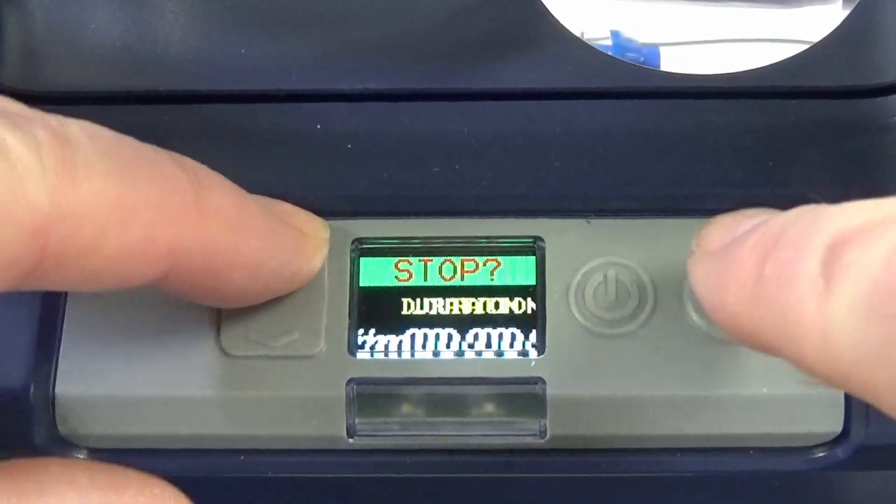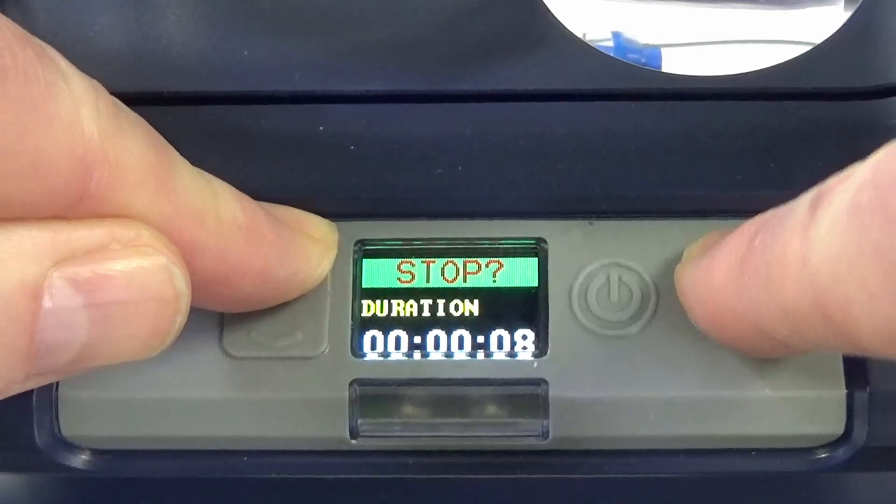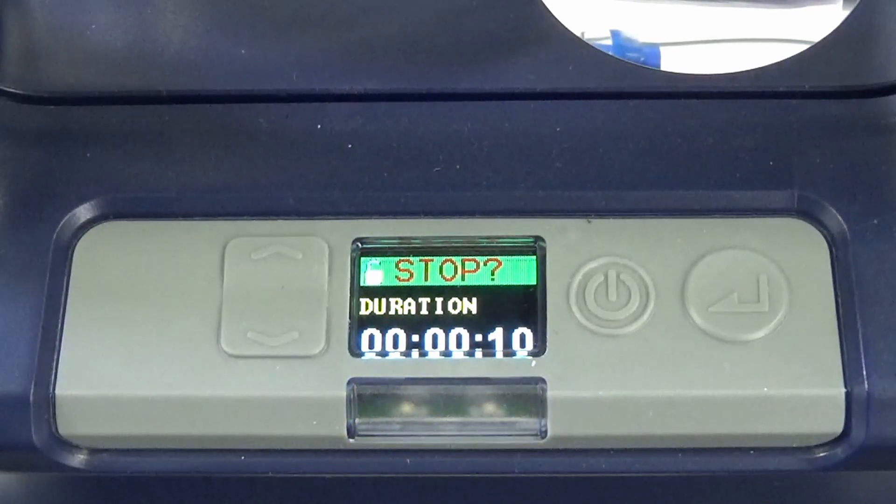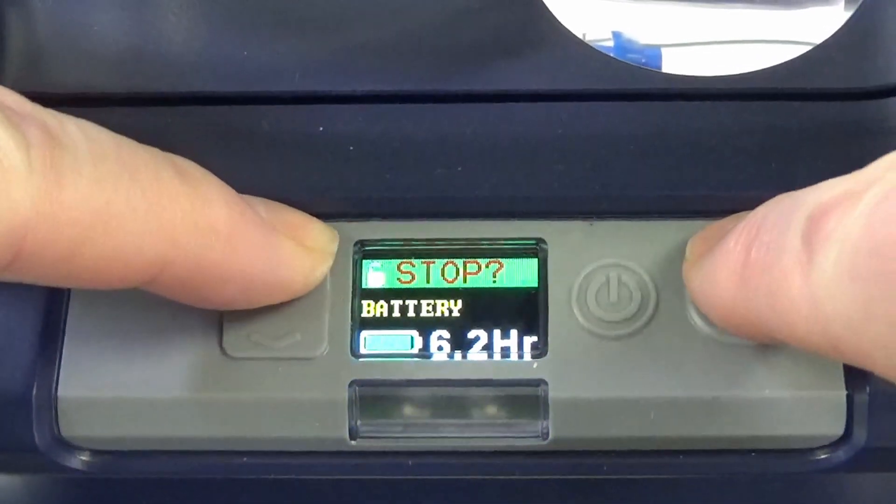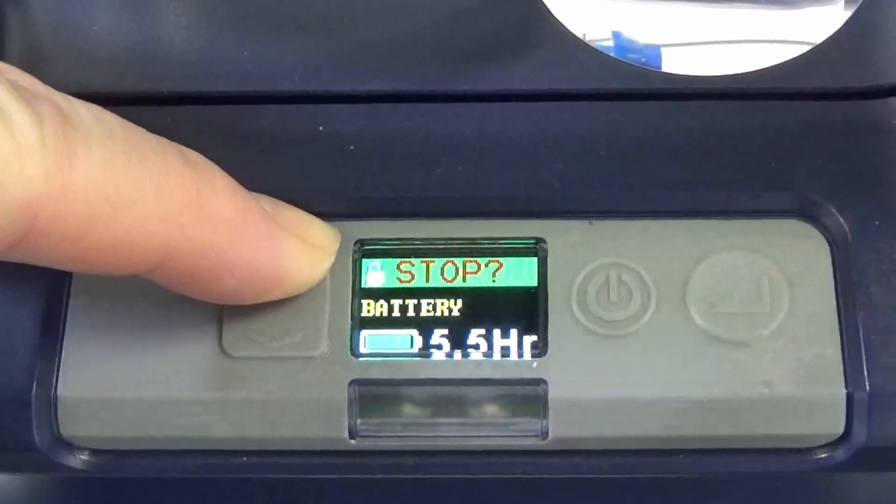If the pump is going to be left unattended, then the keypad can be locked to prevent tampering. To lock the pump, hold the up cursor and tap the enter key 6 times.